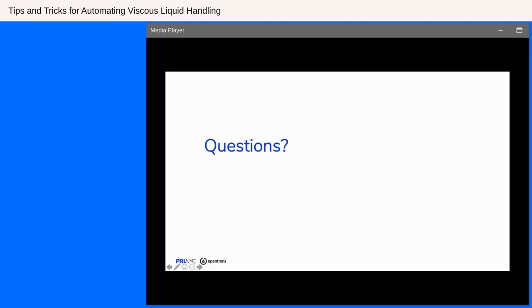So the idea is to reduce your flow rate. There are some applications which require you to work at lower temperature, for example PCR and qPCR applications. A good way to handle these situations is to lower the flow rate from what you're using for your current viscosity. It's always a good idea to look at the viscosity chart, compare with your previously used liquid, and reduce the flow rate accordingly. And then withdraw the tip slowly.